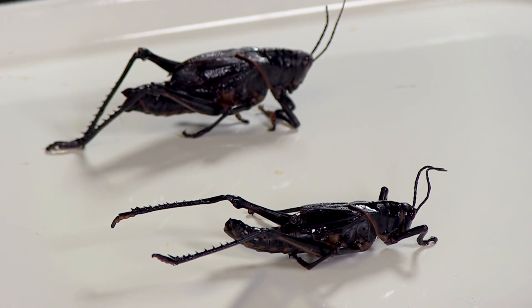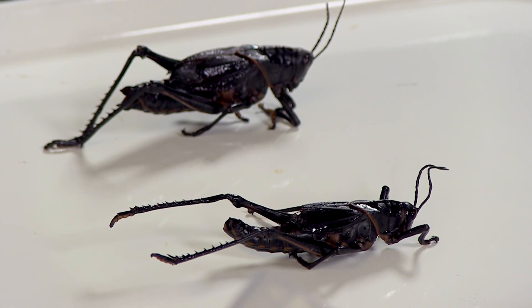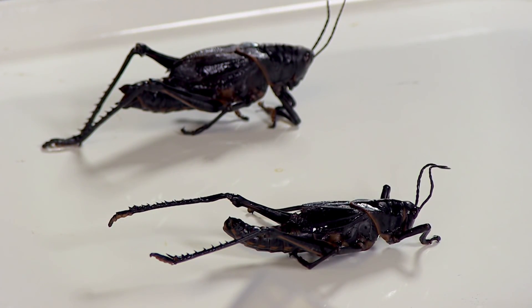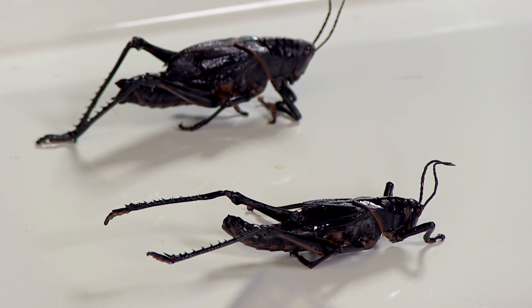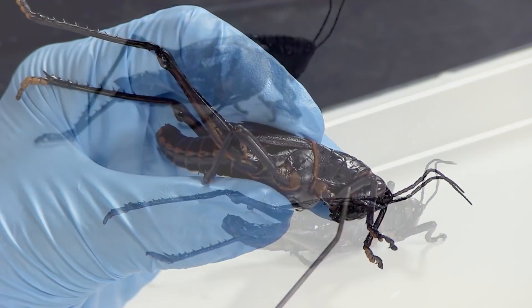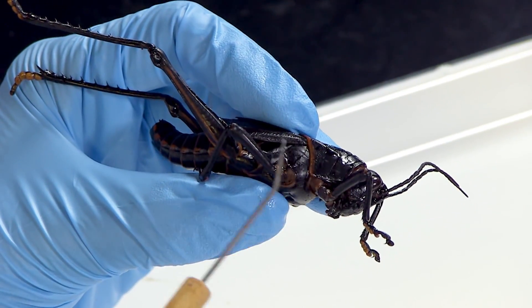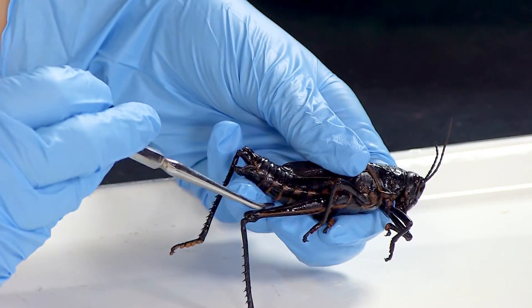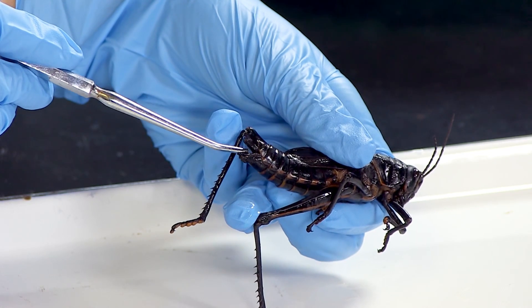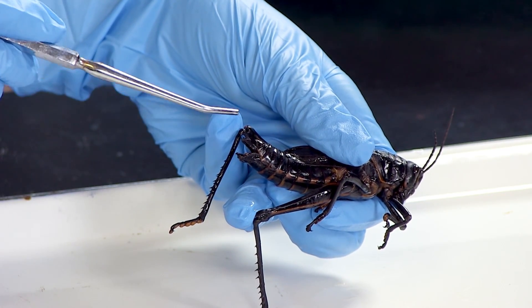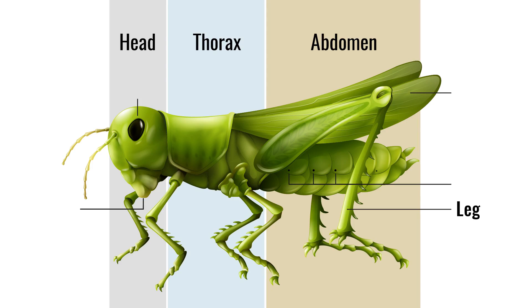Observe the external anatomy of your grasshopper as described in the arthropod learning unit that accompanies this lab. Locate the head, thorax, and abdomen. See if you can determine whether your specimen is a male or female. Then observe the legs, wings, spiracles, eyes, and mouth of your grasshopper.